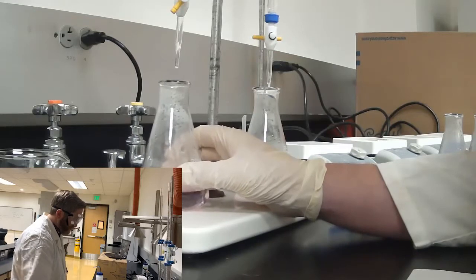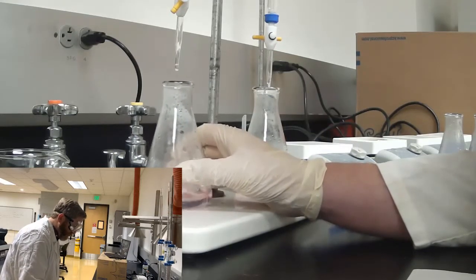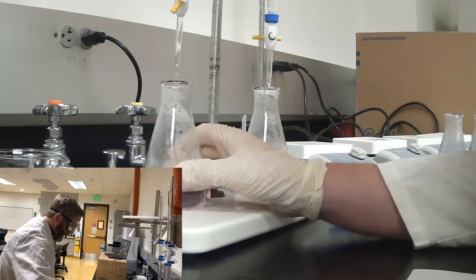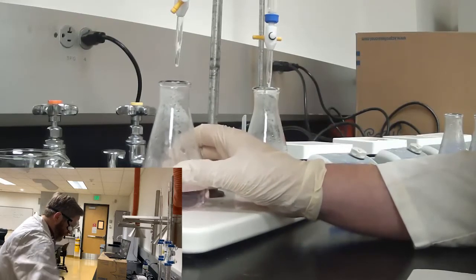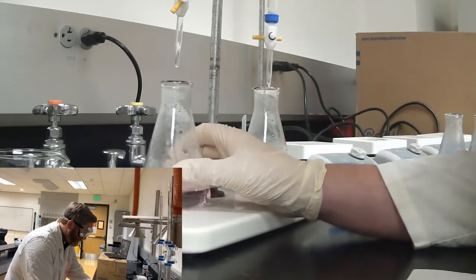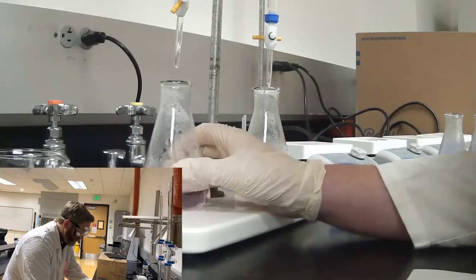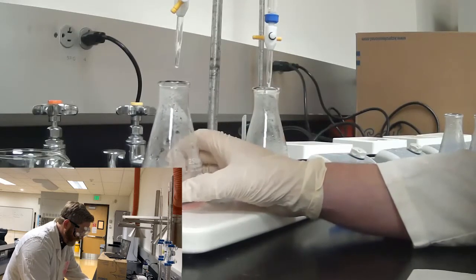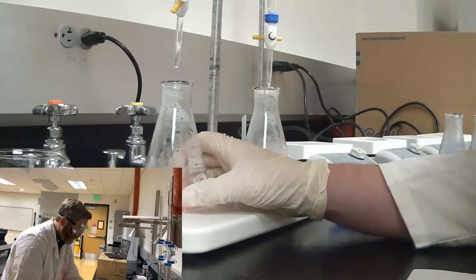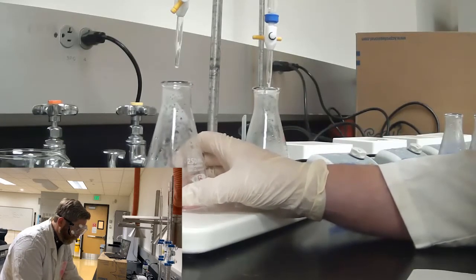As we talk a little bit more about burettes, I'm going to rinse down the sides of these really quickly to make sure that if there was any acid that came up, we incorporated it into the volume at the bottom of the Erlenmeyer flask. Adding excess water, since water is already neutral, will not change significantly the amount of titrant required. They're still pretty warm.